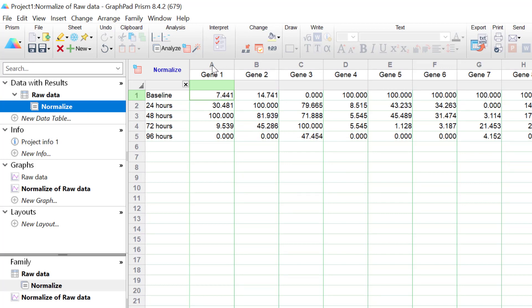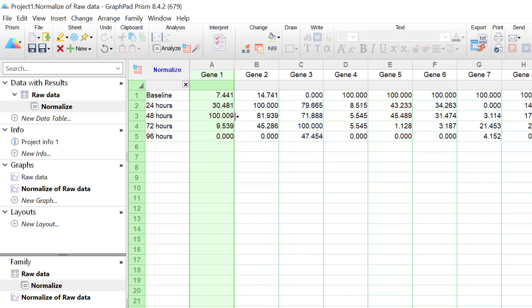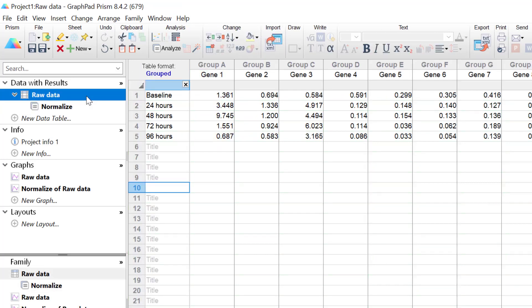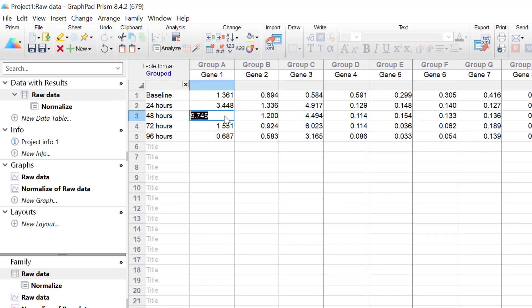If we look at the data for gene 1, you can see that the value for 48 hours is 100%. And this is because if I go back to my RawData, see that this value here contains the largest gene expression value within this column.